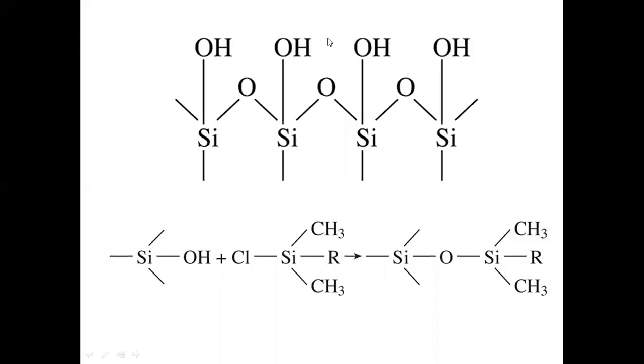we cannot expect a proper interaction of the solute with the stationary phase, because these OH groups may become responsible for physical adsorption, and this physical adsorption may lead to increased band broadening. So in order to eliminate this problem, these OH groups must be inactivated or deactivated, or they have to be blocked. This will be done by chemical treatment.